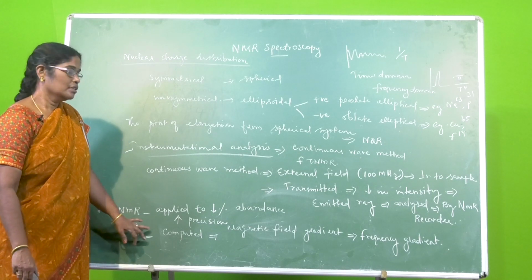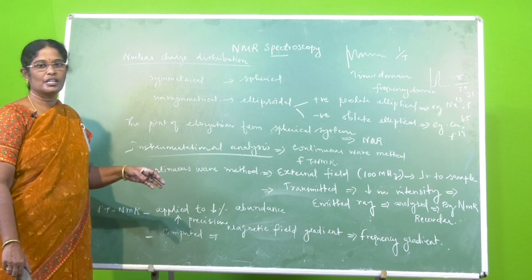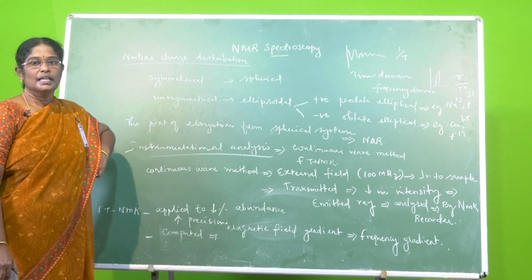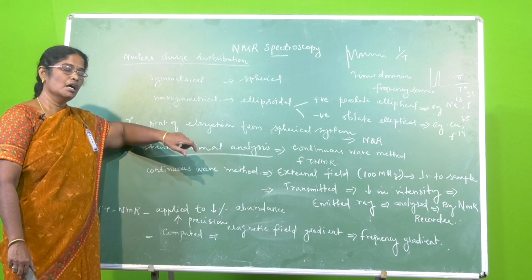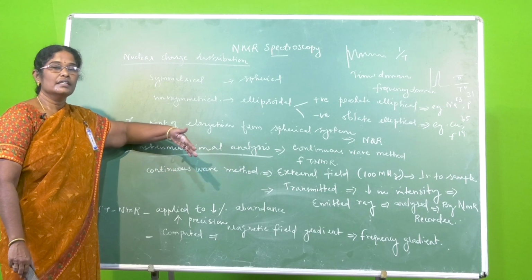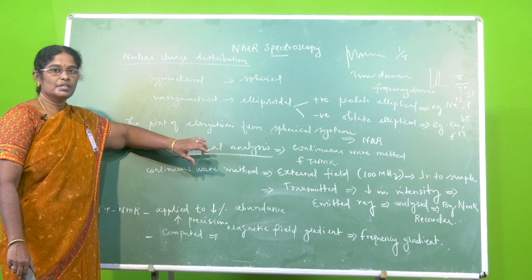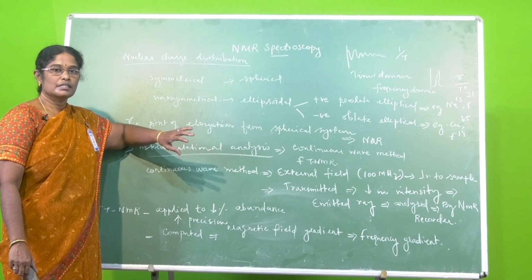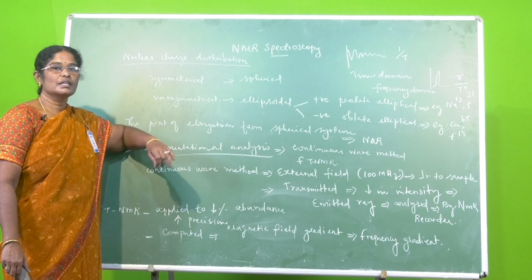So here also this is more preferred for the reason that it is so much accurate and precise, and also this is applicable for the systems where there is a lesser percentage of abundance of the existing molecules. Say, for example, carbon-13, where the percentage abundance ratio is lower, then this system of FT-NMR computational analysis can give an absolute idea about the protonic, that is, the isotopic environment that is responsible for the magnetic flux that in turn can resonate with the external applied field.